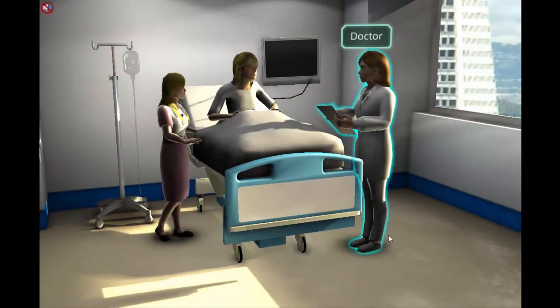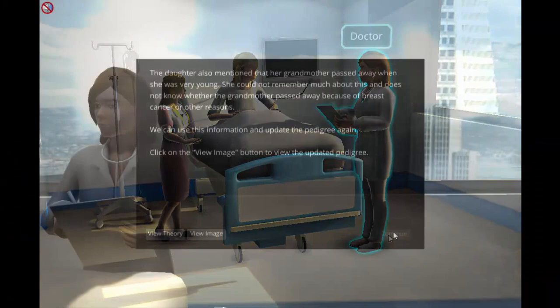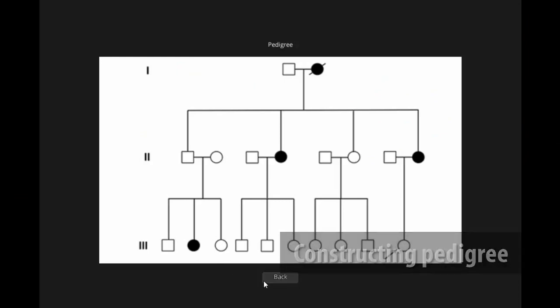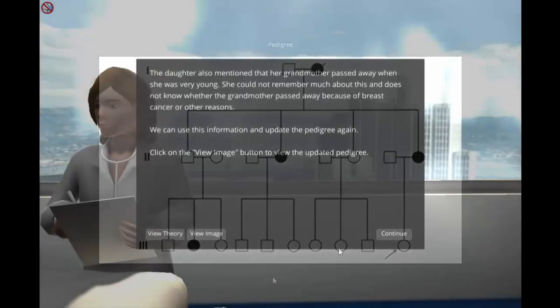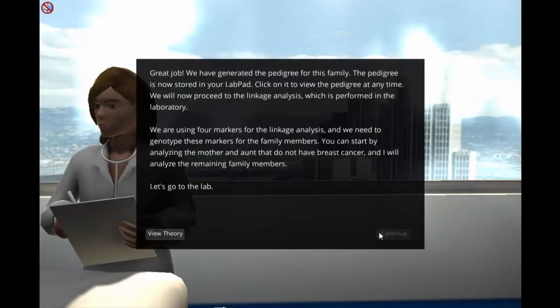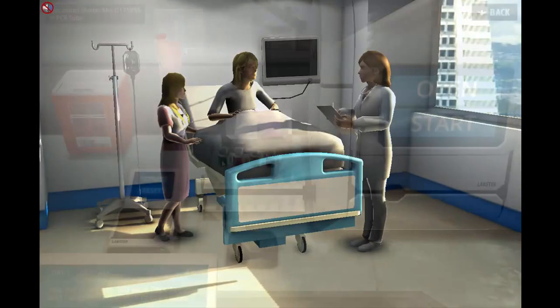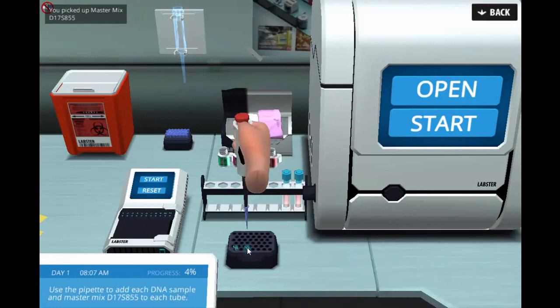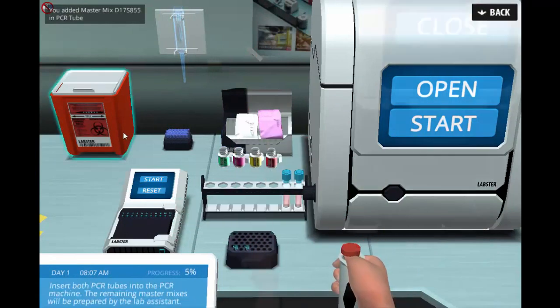In the hospital introductory scene, students construct a family pedigree based on gathered information. After planning their experiment, students arrive in the laboratory and begin experimentation.